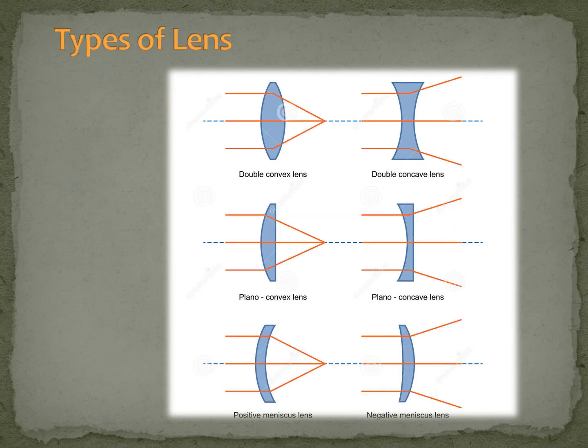So taking these properties into consideration, the refraction of the light rays when they move from one medium to another, and the angle of the surface, we can have the double convex lenses, the ones we've been talking about, but in fact many other types of lenses can be made that will diverge light, that will disperse light in different ways, and according to their own wavelengths, this dispersion can be higher or lower.